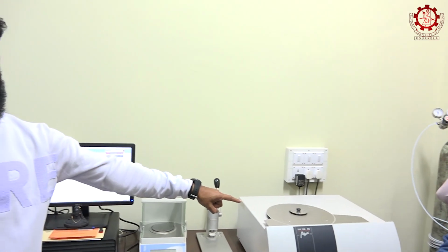Calorimeter is nothing but a device which is used to measure the heat changes. Heat changes means there are so many thermal events like melting, crystallization, glass transition, and decomposition of the given sample. The model here is DSC 200 F3 Maya.